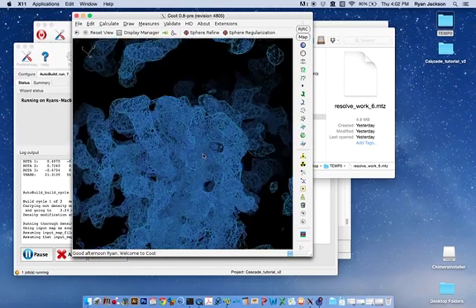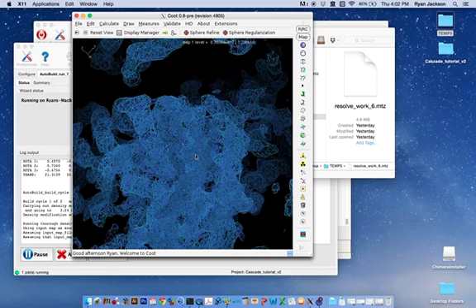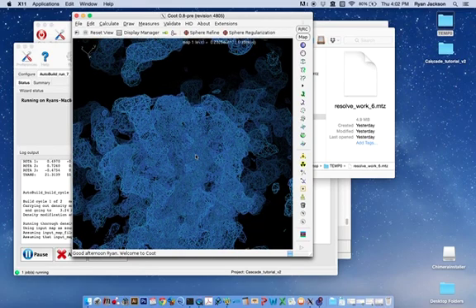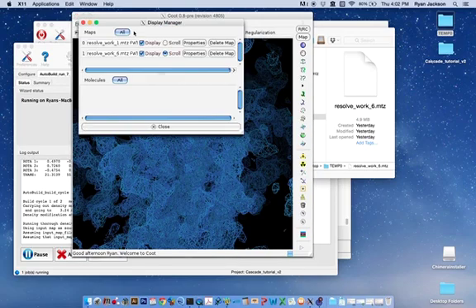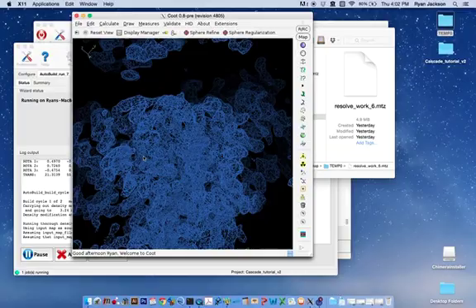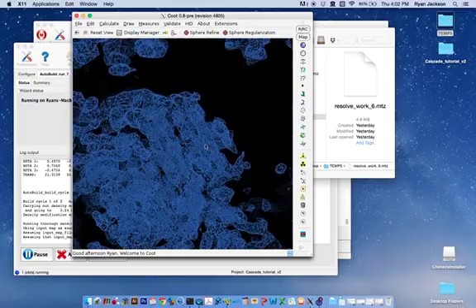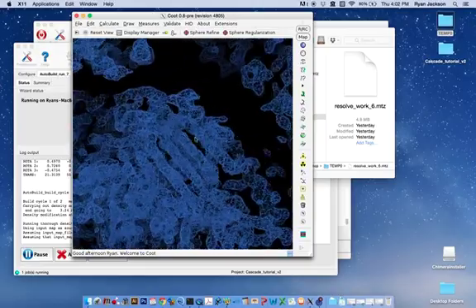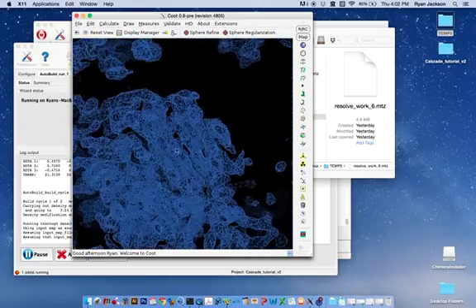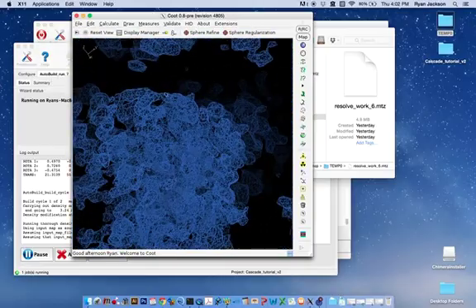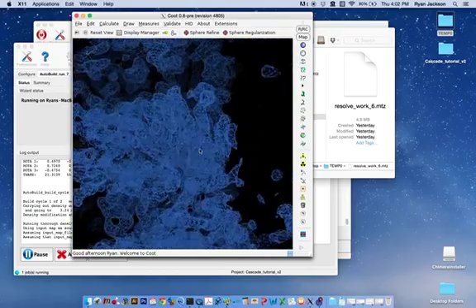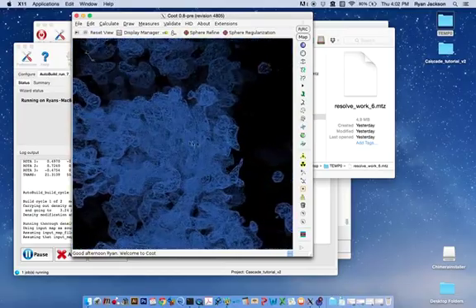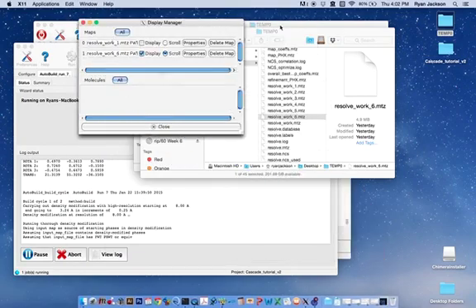But here now as you toggle, we'll get this to the same contour level and as we toggle between the low resolution and the higher resolution you can see now that especially there in the middle that now you can see beta sheets and alpha helices and this is, you should be able to analyze this progression as you run through macro cycles.